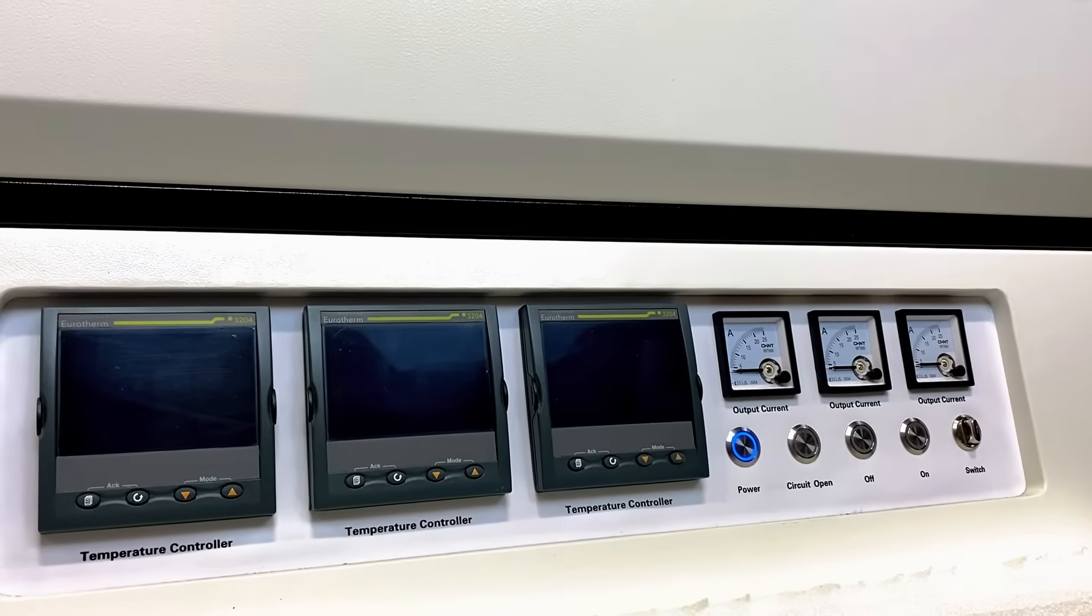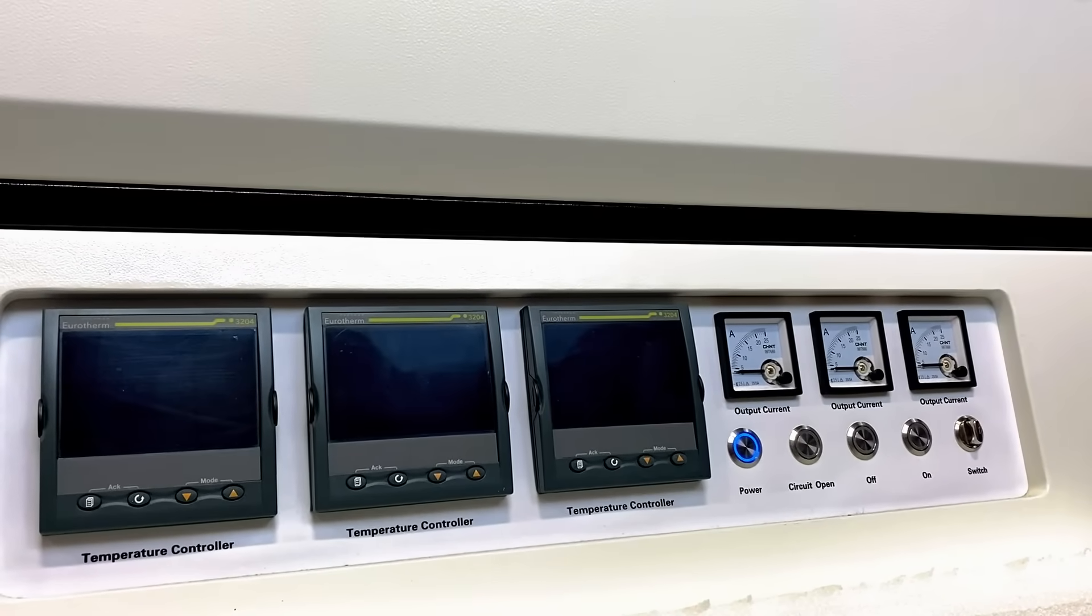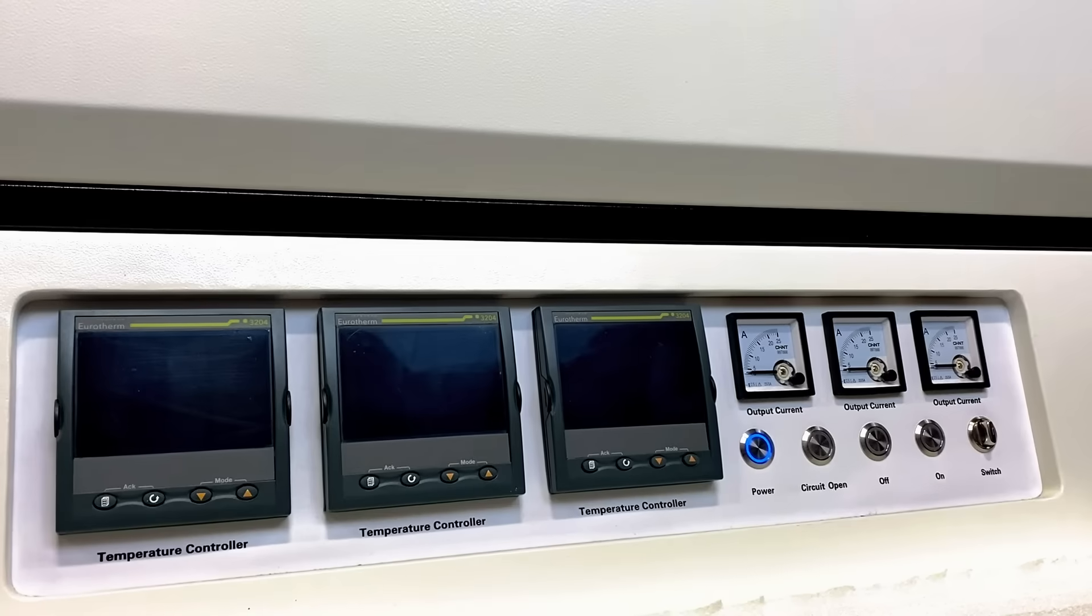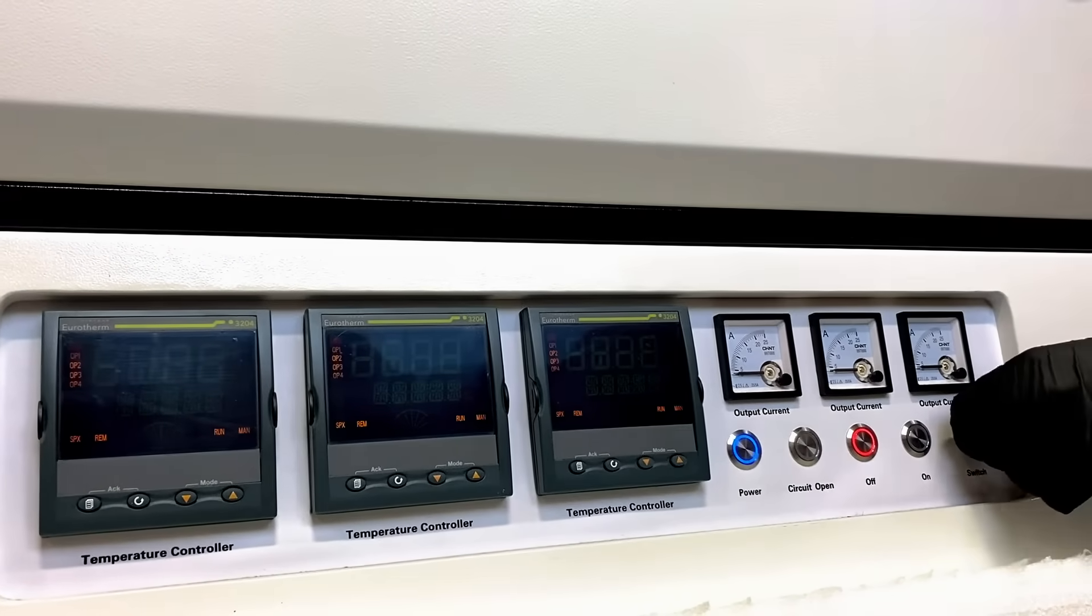To program your Across International tube or chamber furnace temperature, first connect to the power supply and switch the furnace on.